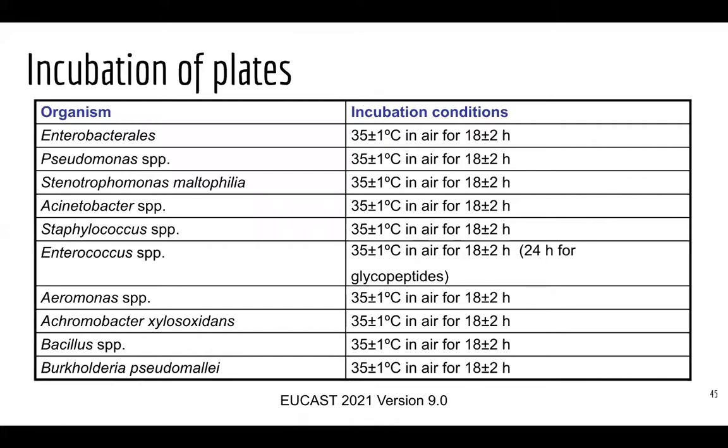So for example, if it's a predatory bacteria like Bdellovibrio, and I used to work with Bdellovibrio, although this isn't used in EUCAST testing, it can take 14 days for it to grow, because it actually requires a lawn of bacteria on the surface already, and then on that lawn, the plaques that it creates will take a very long time to form when you're doing genetic work. And it is a bacteria, so it's quite interesting.